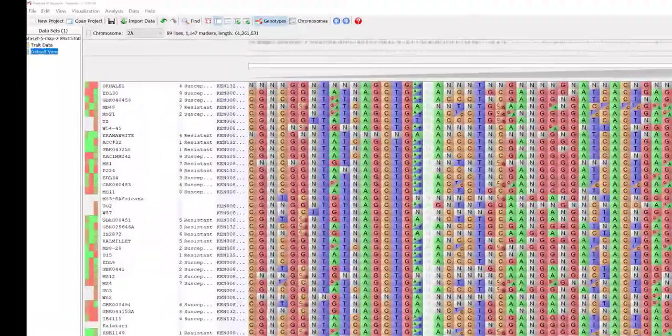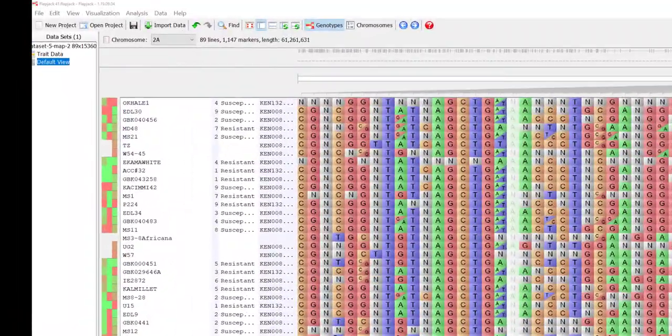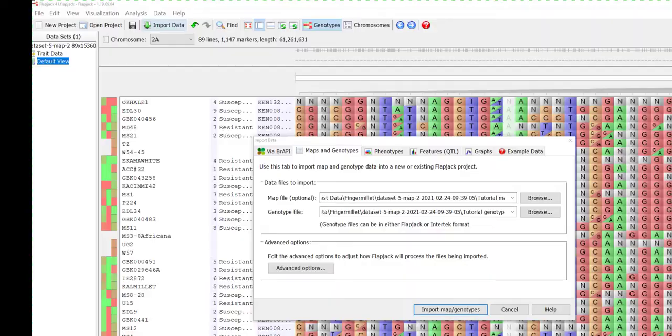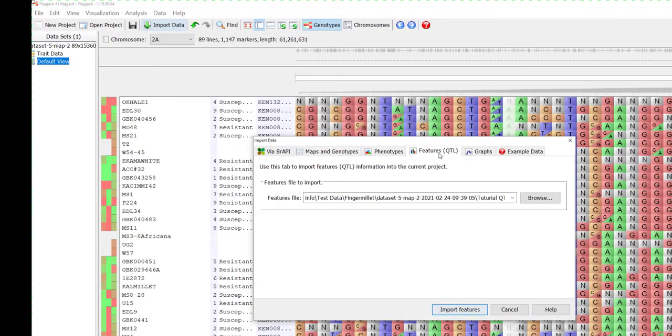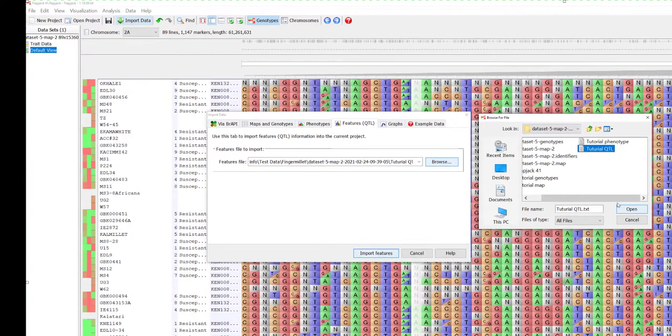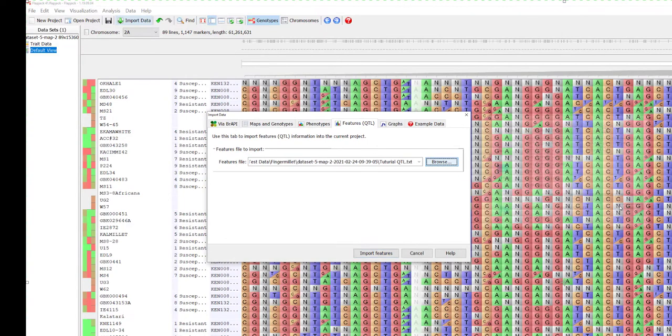To import QTL or features information, again use the import data options available. Browse and select the appropriate file and click import. A helpful summary window will appear.